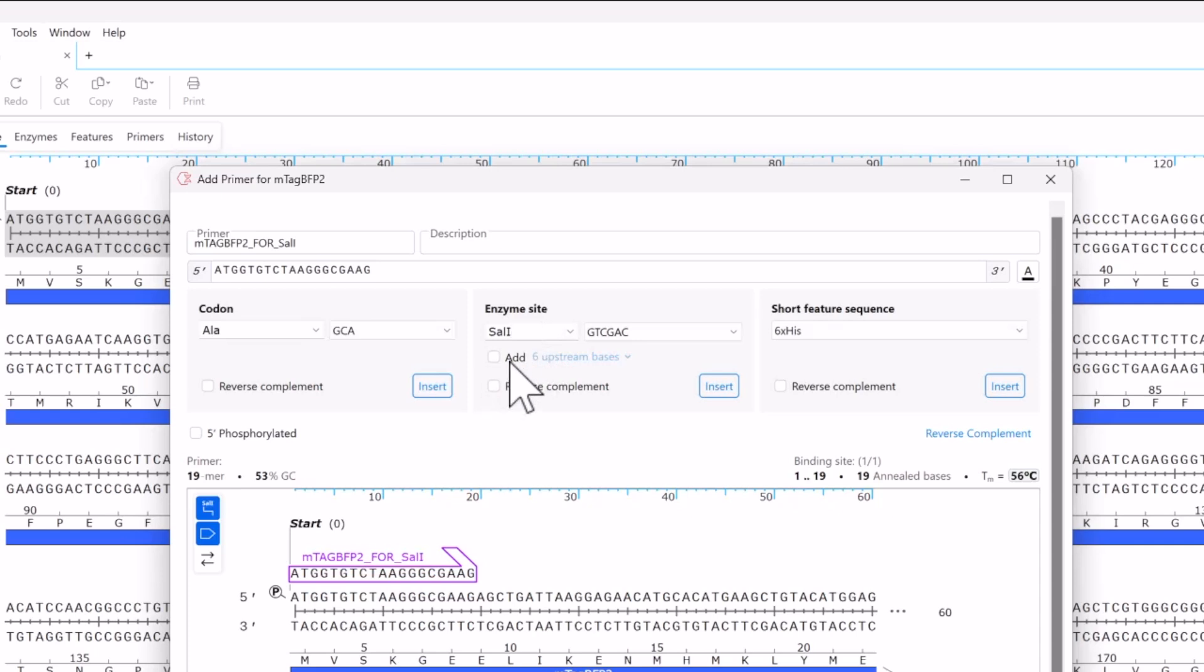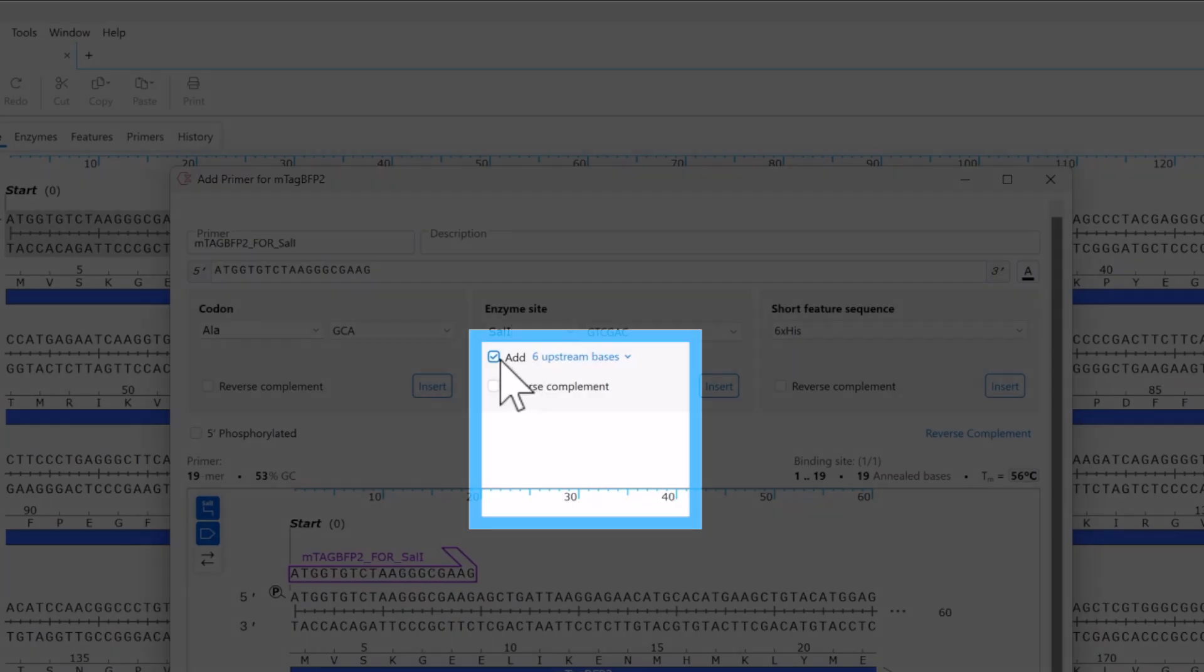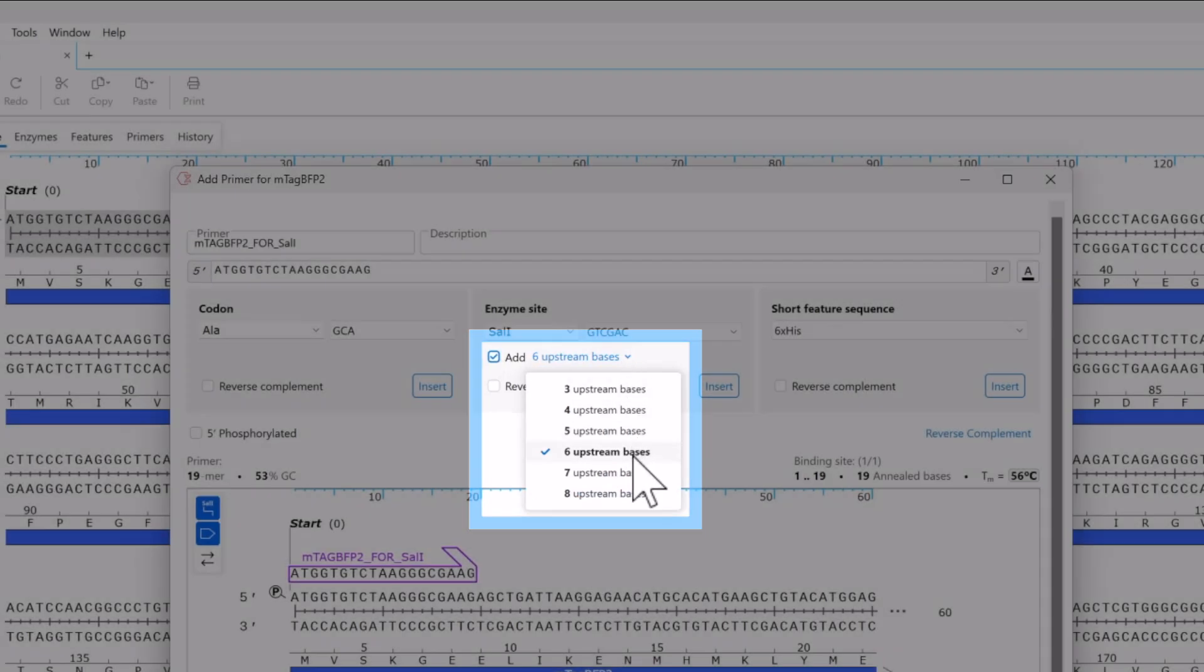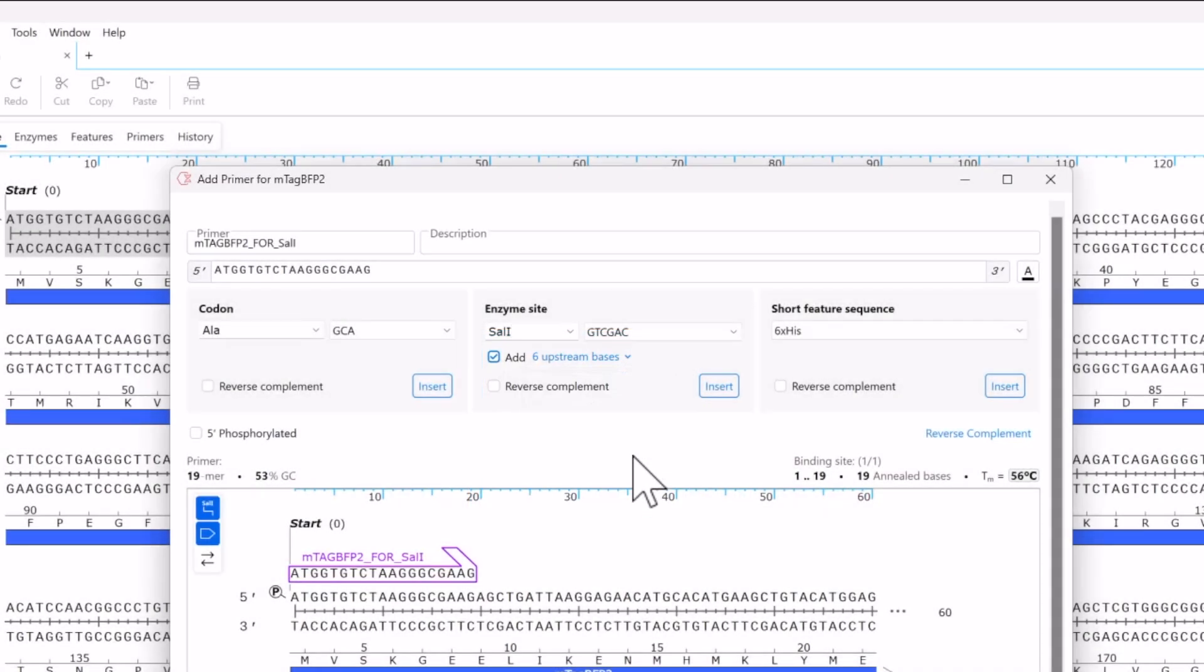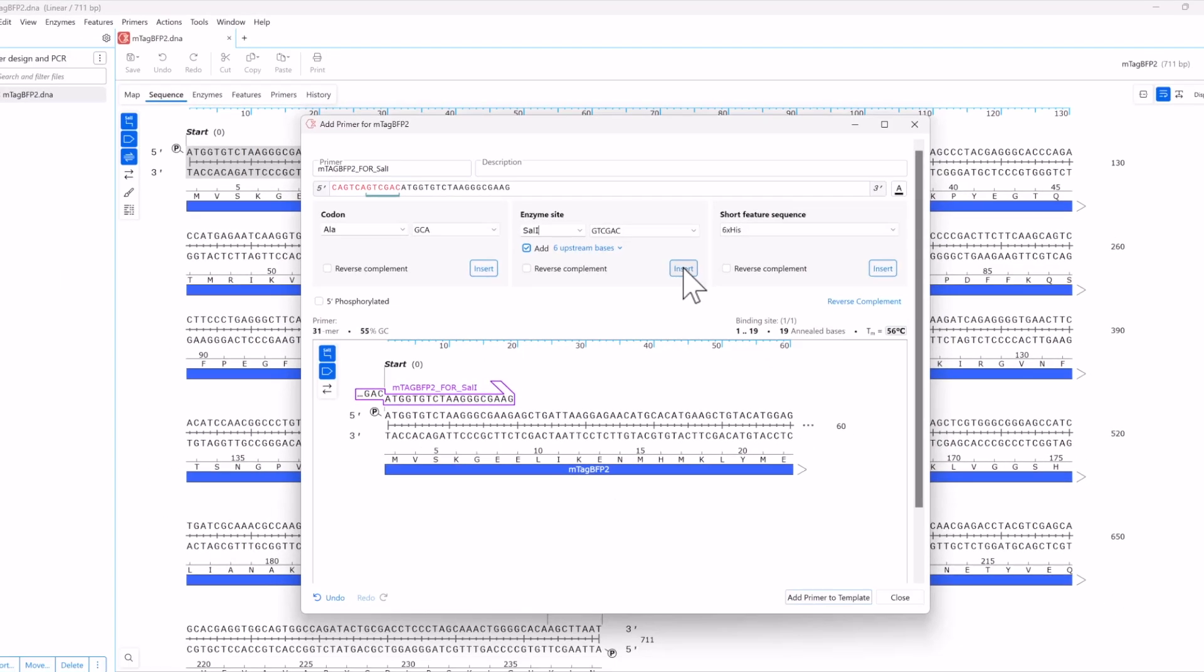Using the insertion tool, you can type the enzyme name or use the dropdown to select your desired enzyme. Many restriction enzymes cut more efficiently if they are not at the immediate end of a sequence. Check the option and use the dropdown if you want SnapGene to add extra upstream bases automatically. Now click Insert to add the site and upstream bases to the primer.